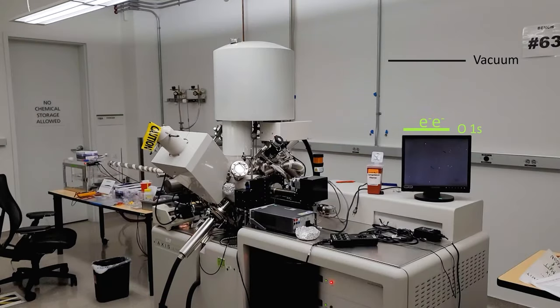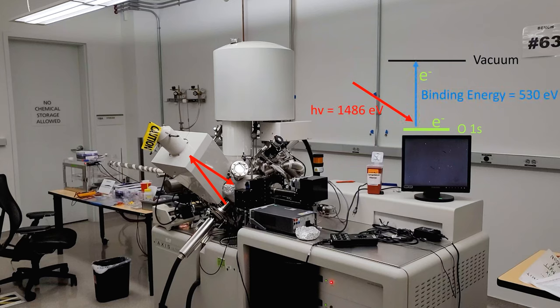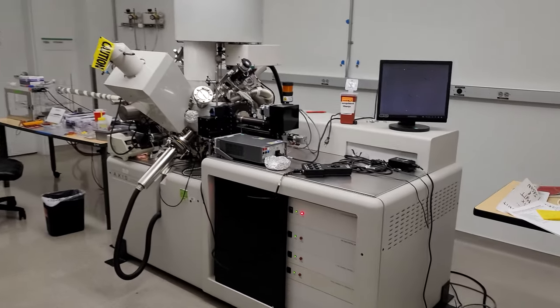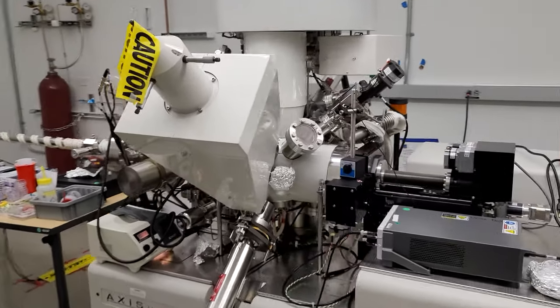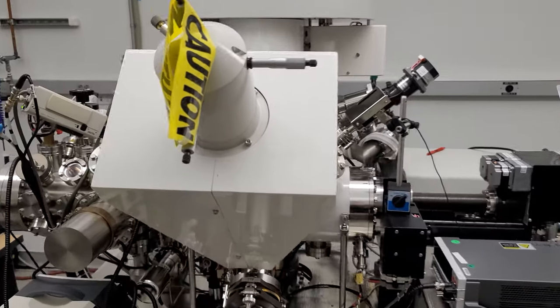X-ray photoelectron spectroscopy, XPS, uses high-energy X-ray light to photo-excite core electrons, such as those in the oxygen 1s, out of the material and into the ultra-high vacuum chamber where the kinetic energy can be measured by the hemispherical analyzer. As such, the binding energy of the core electrons can be determined. The binding energy of the core electrons are distinctly different across elements of the periodic table, allowing for the assignment of elemental makeup of unknown materials.